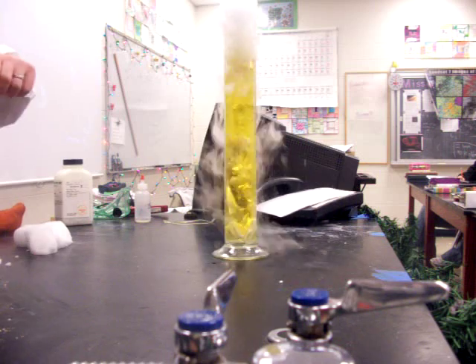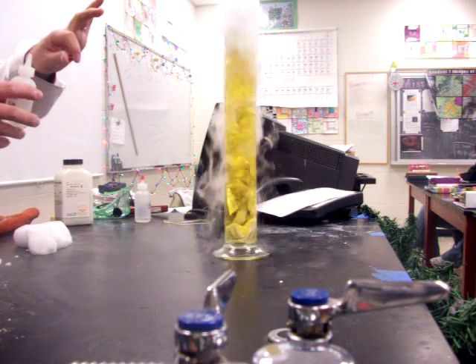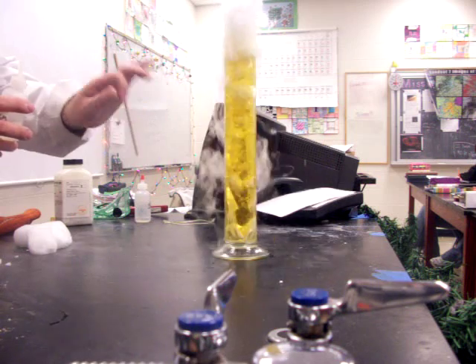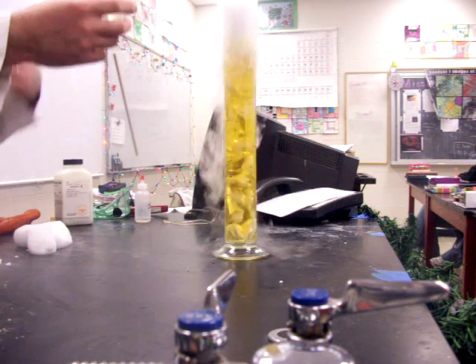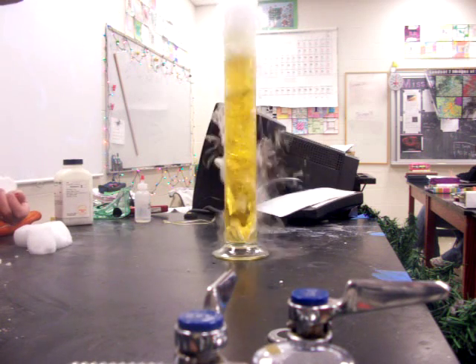To encourage it to go all the way to the acidic range, I'm going to add a little bit of acid. Carbon dioxide forms a weak acid in the water, so I'm going to add a little bit of a strong acid to push the color change all the way into the acid range.